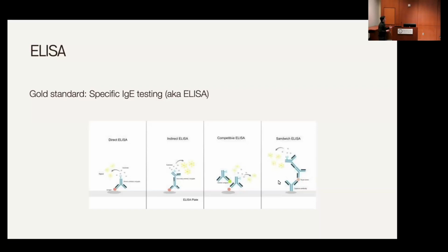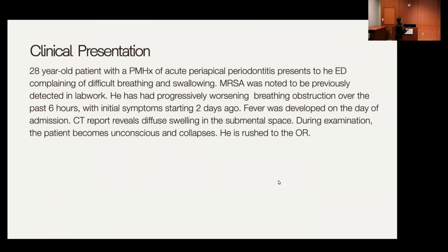And if the enzyme-linked antibody is always the last step, then the first step must be an antibody, and the second step must be the antigen sandwiching the antigen. Okay, now we'll be moving on to a practical application of the ELISA test.